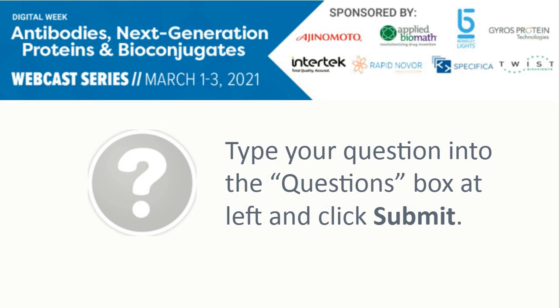Great, thank you. On to the next question. How much of the purified AB material do you use for polyclonal sequencing? Yep, great question. So hopefully I just answered that one as well. We're looking for roughly 1 mg of the purified polyclonal antibody fraction after the affinity purification. So that's what we're looking for.